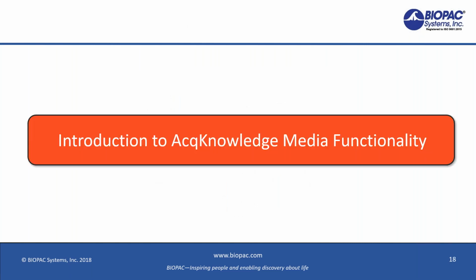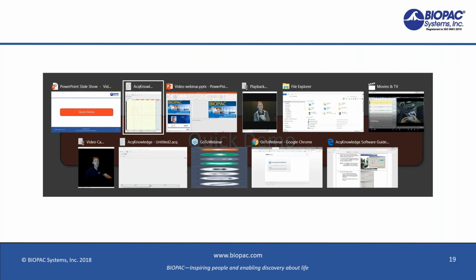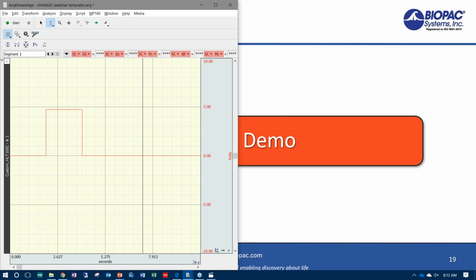Now what I'm going to do is move on with the actual physiological data collection and video integration portion of it. So let's start with a quick demonstration. I'll show you how I've got everything set up. If I bring AcqKnowledge up. Okay, so here on the left-hand side, I've got AcqKnowledge.